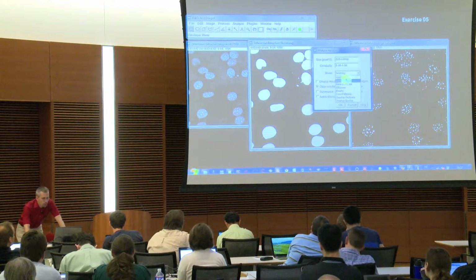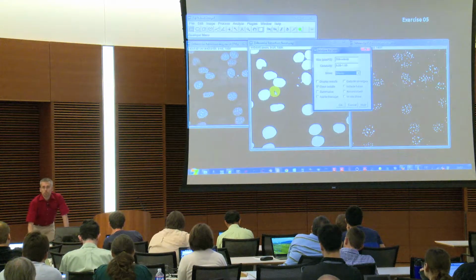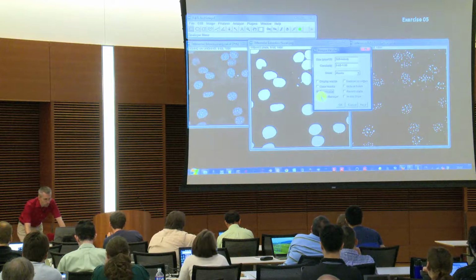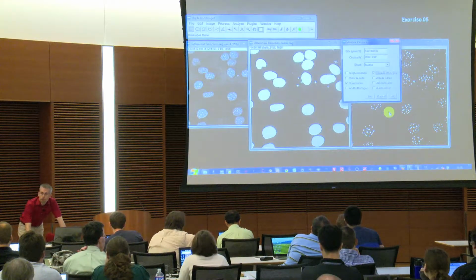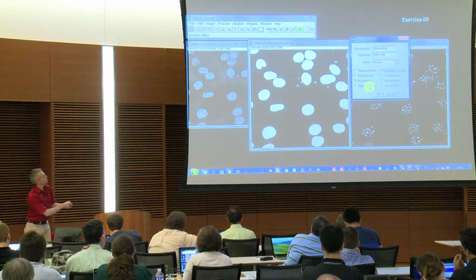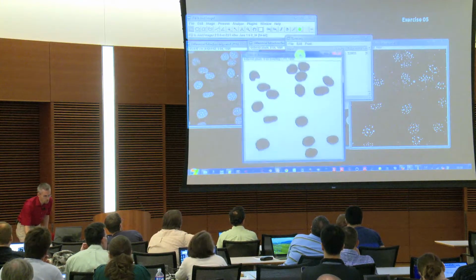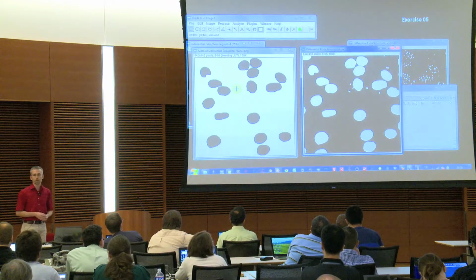What we want to get out of that is finally a mask image, which is basically the same as this one with an inverted LUT and showing only the analyzed particles. We will have a look at the summary window. And as mentioned, we want to exclude edge objects because they're not complete. Okay, so 500 to infinity, masks, summary, and exclude objects. If you now run that, you see you get only those. The small ones are excluded, and the ones which were at the corners are excluded.